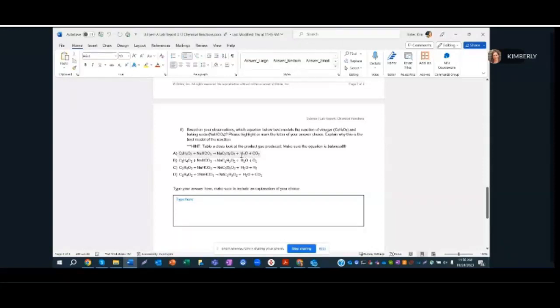Okay, so we saw that was carbon dioxide a possible result listed at the top. And we just kind of look at all 4 of these formulas and see which is a possible gas that was produced.